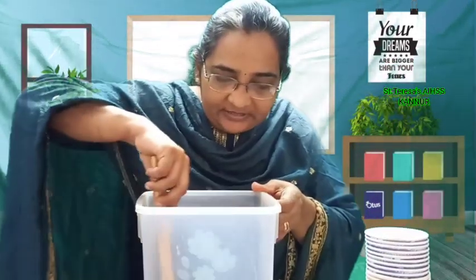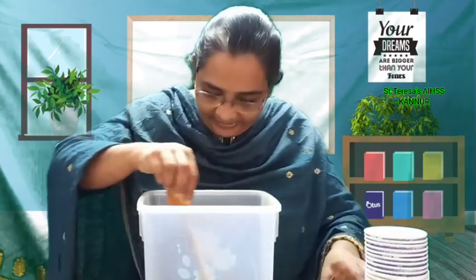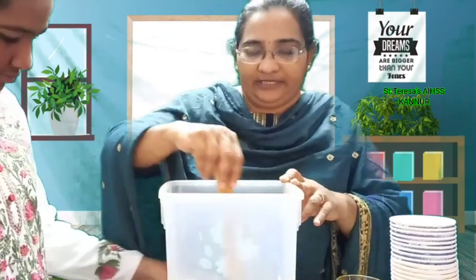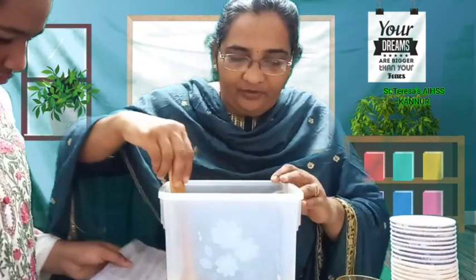I have mixed it. Now I am stirring it well. We have to mix it for at least 10 minutes. So I have to keep on mixing.